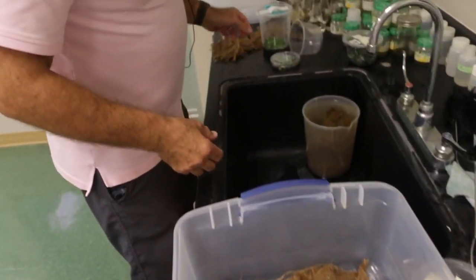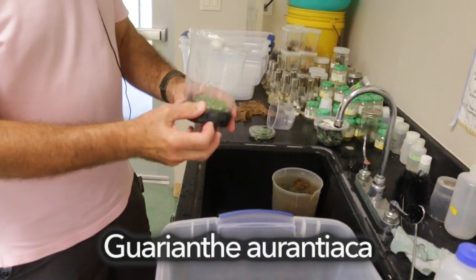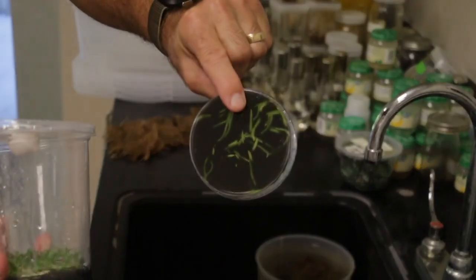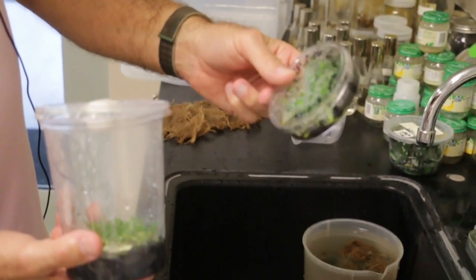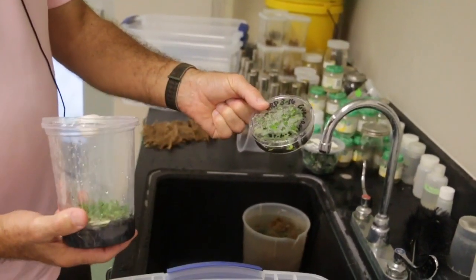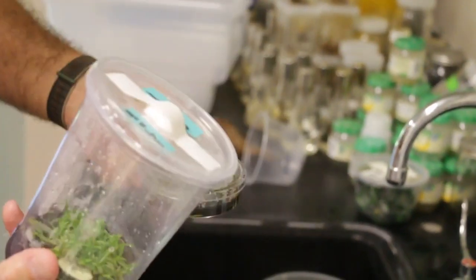Okay, so let's get another container. And what I'm going to do here, and we'll see how this goes, these are Guarianthe aurantiaca. These were growing really quickly, but again, the problem is I've got contamination in this flask, and I've got a dish here, and there's contamination in this dish. But you can see the growth of the roots. These are going to be harder to get apart, but you can see what the growth looks like. These were placed in this medium 2 months ago. That's the mark right here. I only know that because of the mark on the dish. So these were placed as very small seedlings in here 2 months ago, and the roots weren't like that. It's incredible growth. So these things grew quickly.